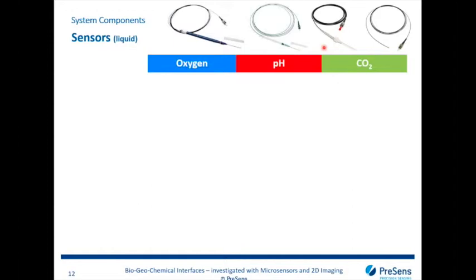The third type of sensor that we have is the so-called NFSG, which stands for fixed needle type sensor. Why fixed needle type? Simply because the fiber can't be moved inside the syringe anymore, but it's actually fixed. So it's glued inside here to a fixed position, only extending a tiny bit, a few microns inside the cannula.